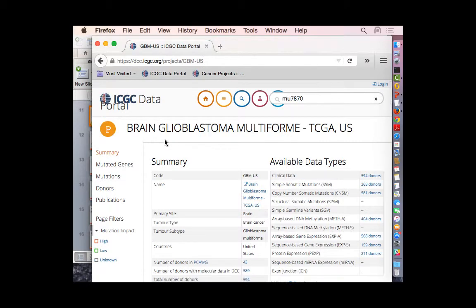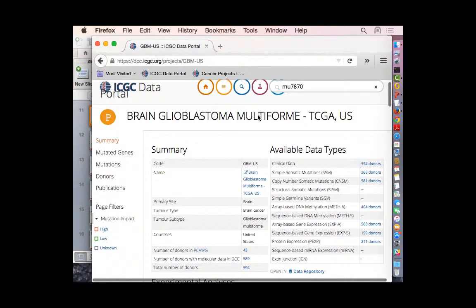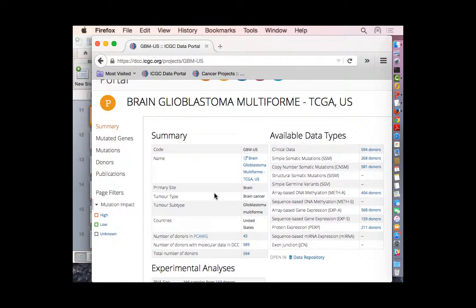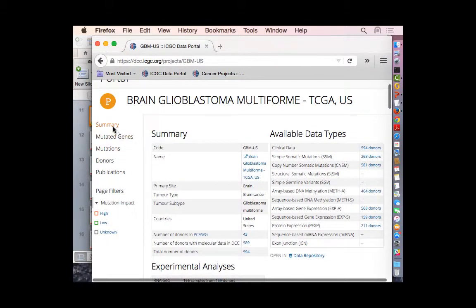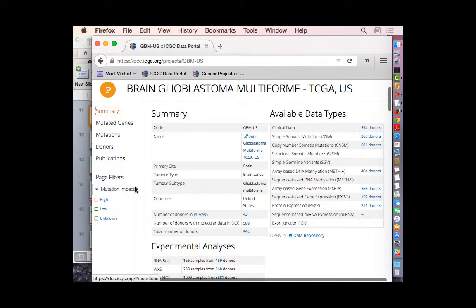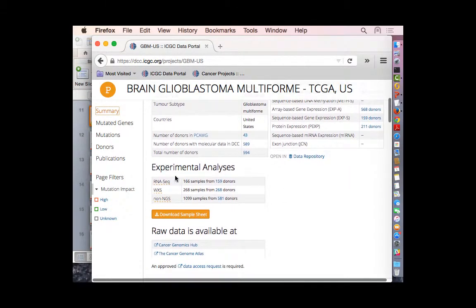Let's click on one of the projects — a brain tumor from a TCGA project. This is what we call a project entity page. We have other entity pages as well: mutation page, gene page, project page, donor page. For these entity pages, we have multiple sections; the left side allows you to navigate through different sections. The first is a summary giving basic statistics of the project: what kind of cancer types, how many donors we have, and what kind of experiment data has been performed for these patients.